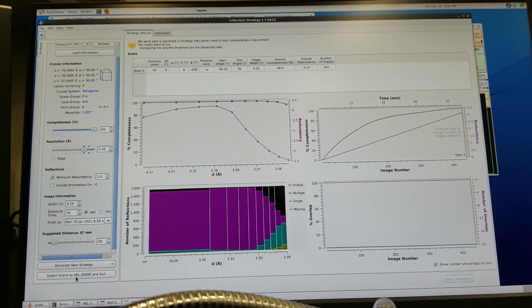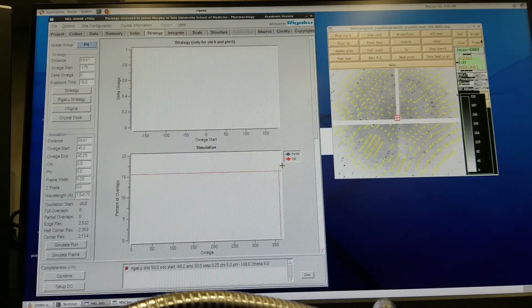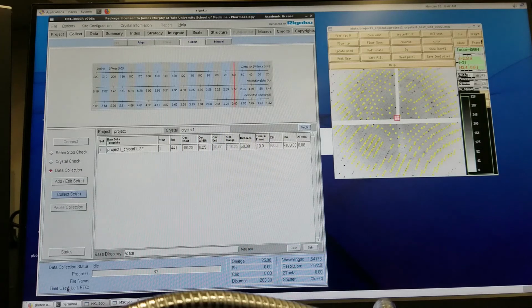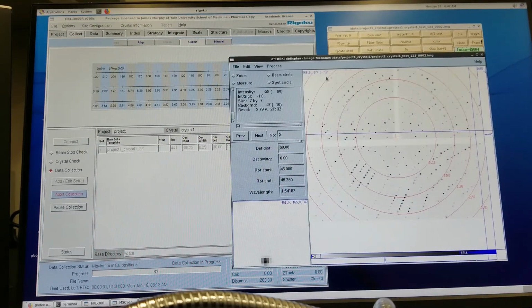So from here, we can bring the scans, the calculated scan, back to HKL 3000. We see it listed here. We then set up our data collection, double check that it's right, we set up to collect. So at this point, the detector is moving into position.